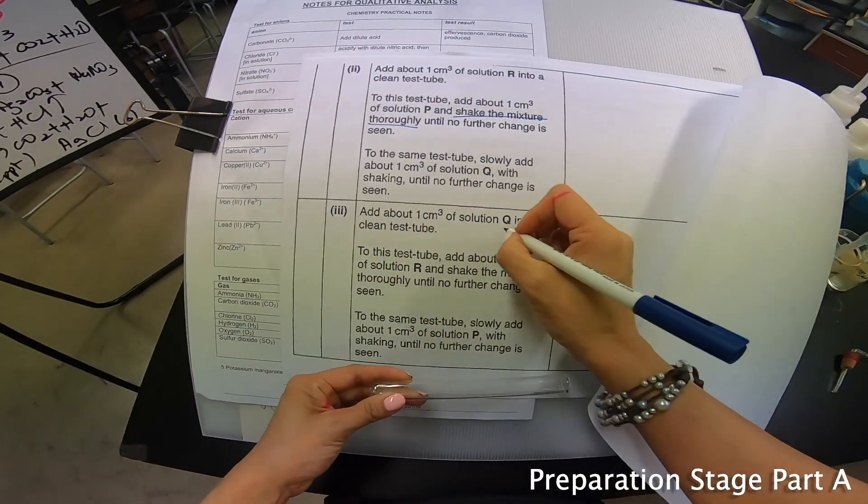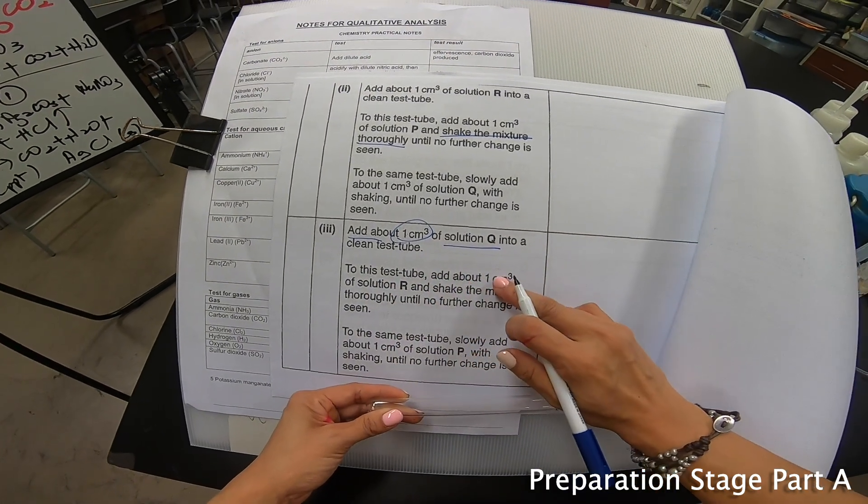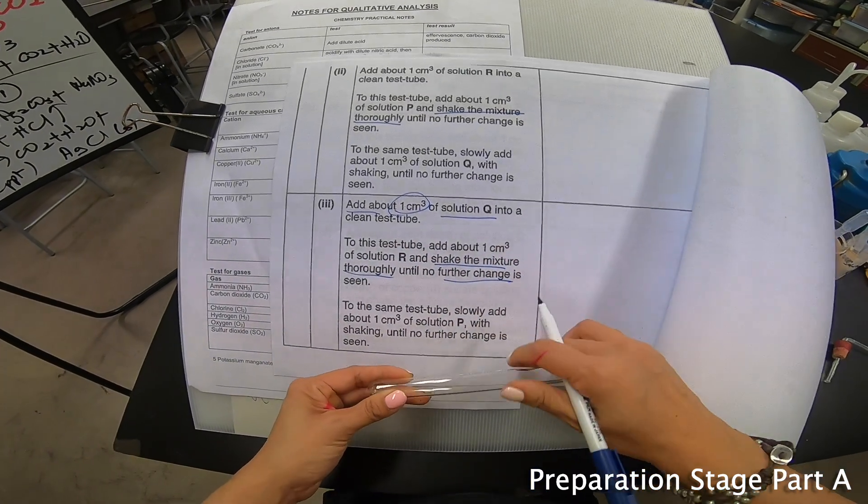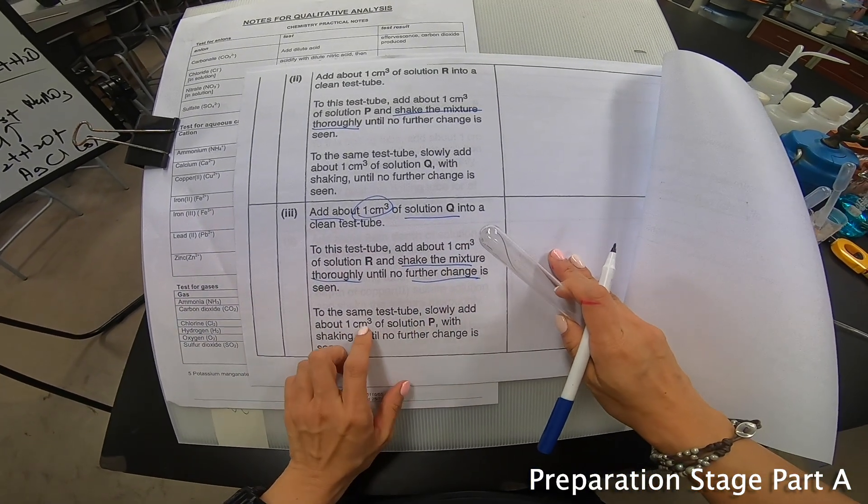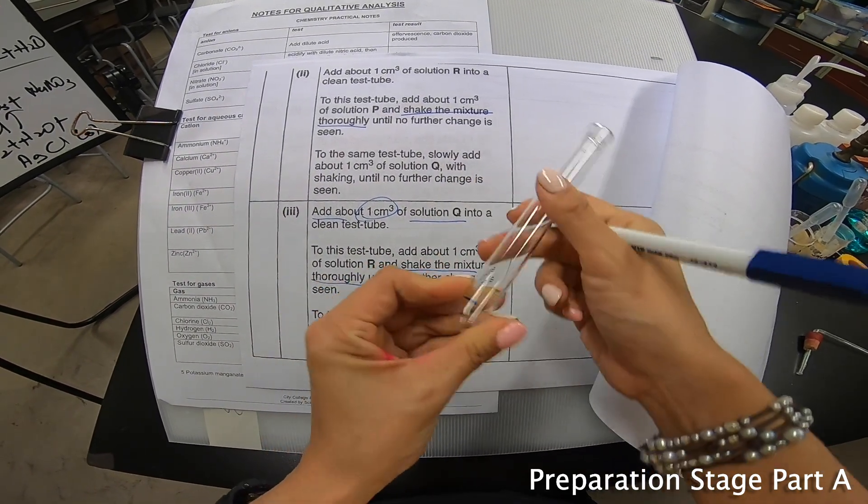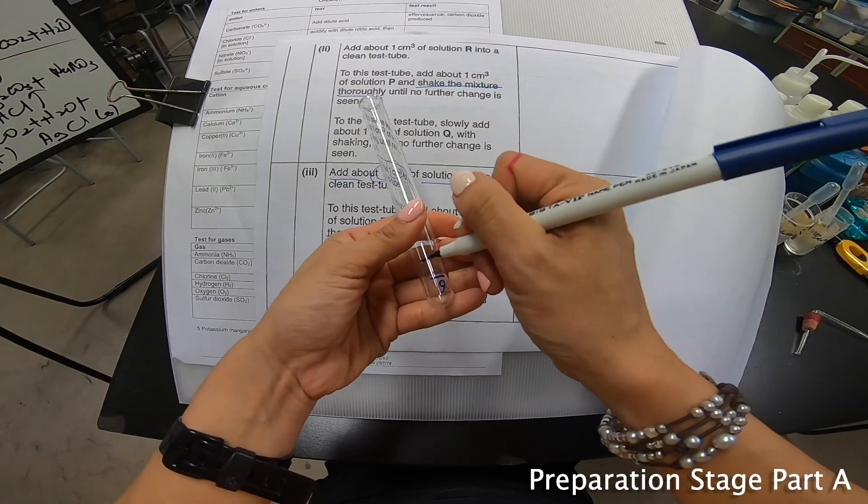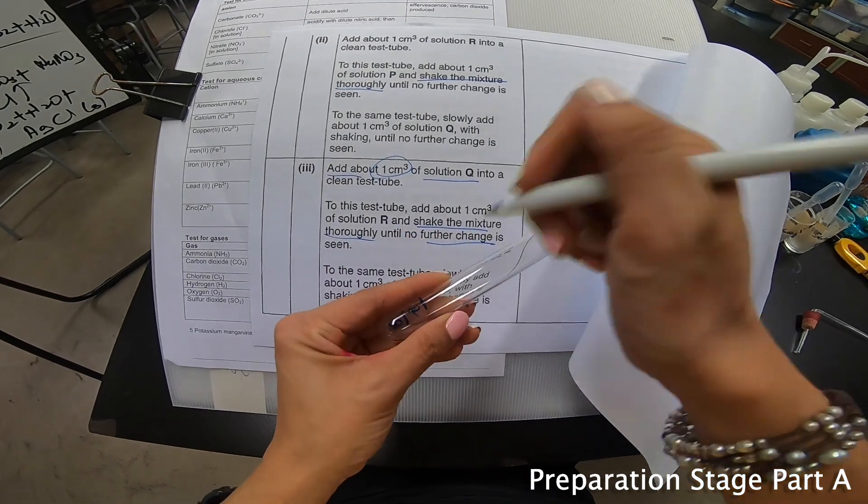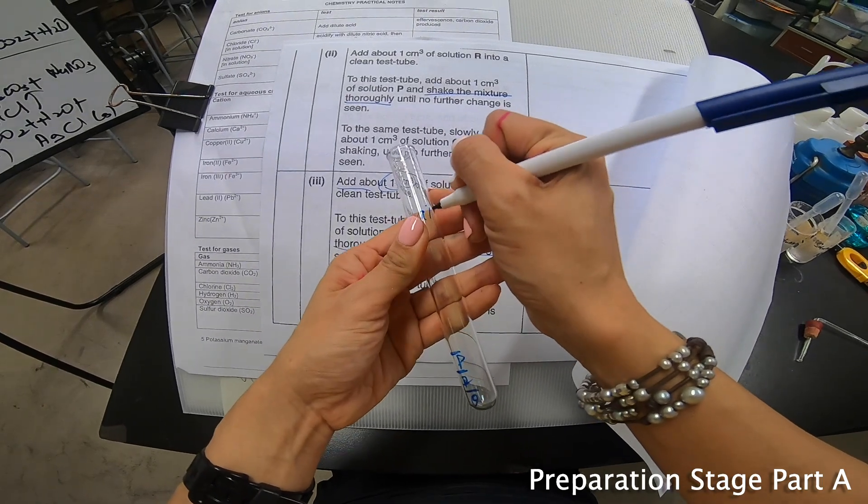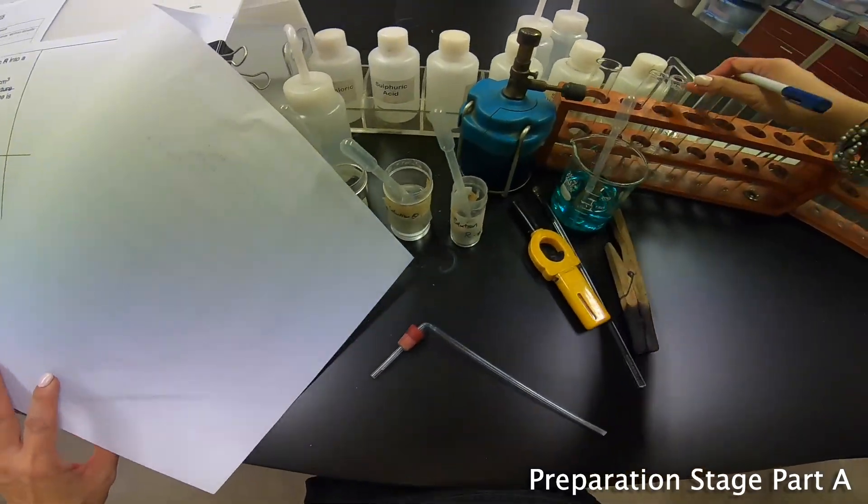It's about the same, but we just keep on changing from R this time around to P to Q. So I make sure I write down properly R, P, and Q. And this is A part 2. Next one, part 3. This round, I add about 1 cm³ of solution Q into a test tube. To this test tube, add about 1 cm³ of solution R. Shake the mixture until no further change is seen. And to the same test tube, add about 1 cm³ of solution P.